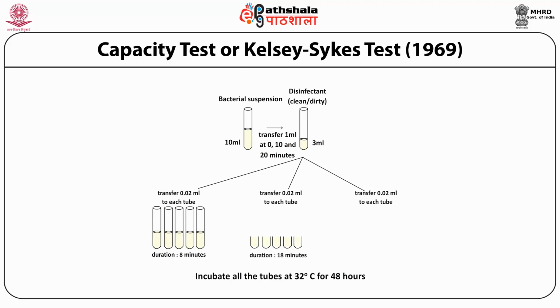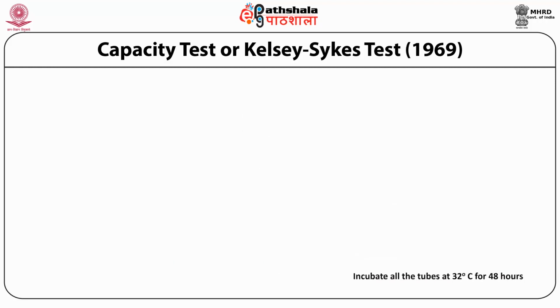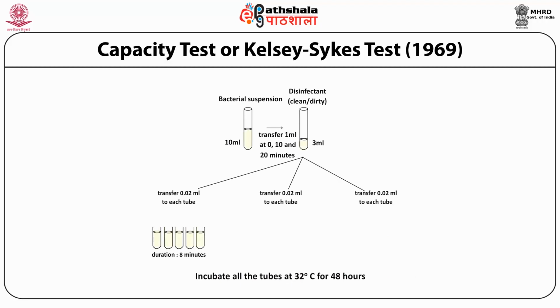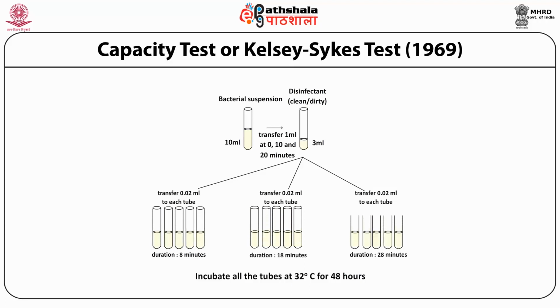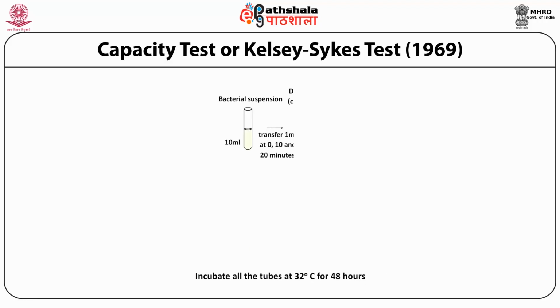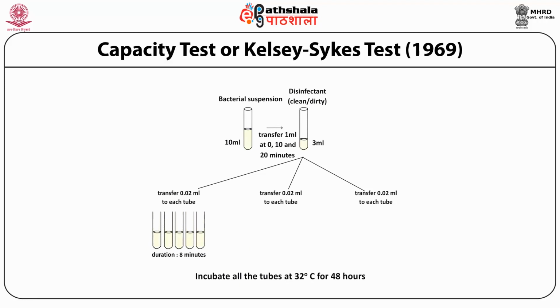After 8 minutes, from the disinfectant tube, 0.02 ml of the microbial inoculum is recultured in 5 other tubes. After 18 minutes, 0.02 ml of disinfectant mixture, and after 28 minutes, 0.02 ml of microbial inoculum were transferred again into 5 new culture tubes.